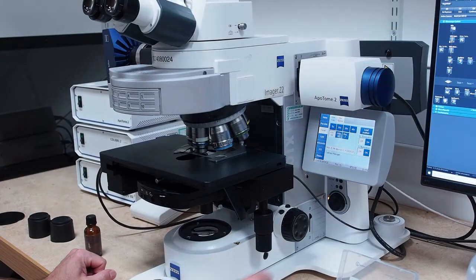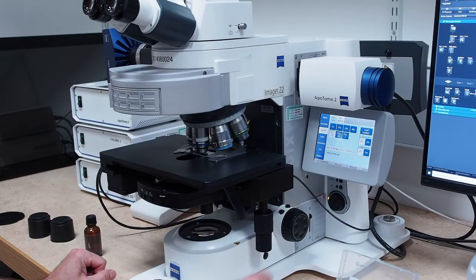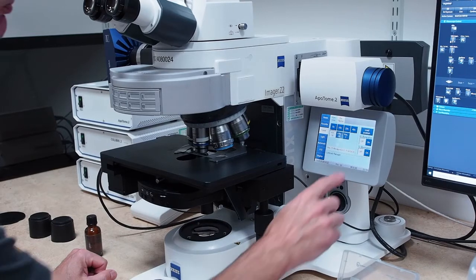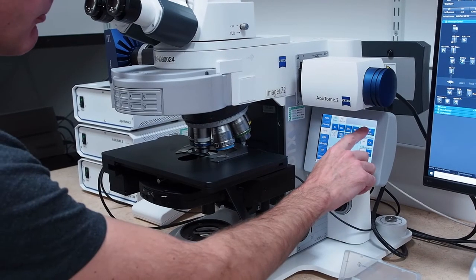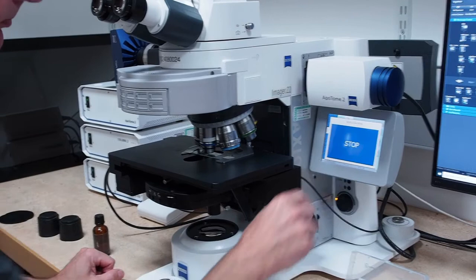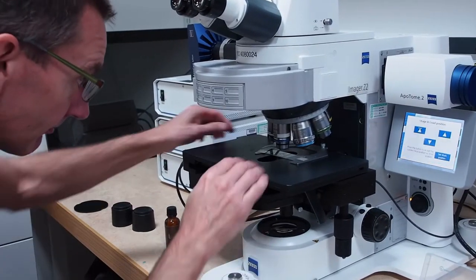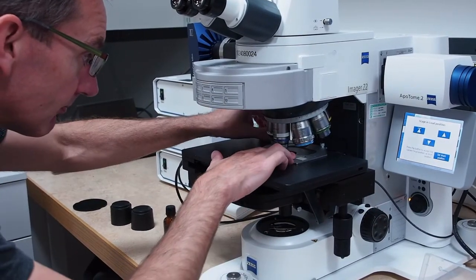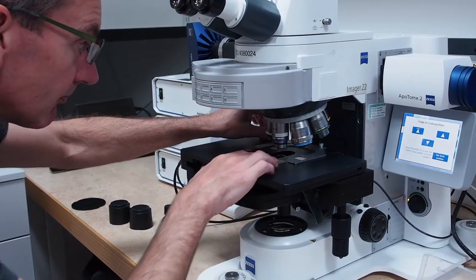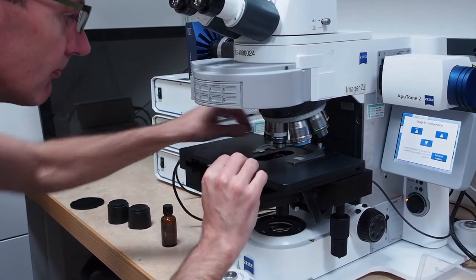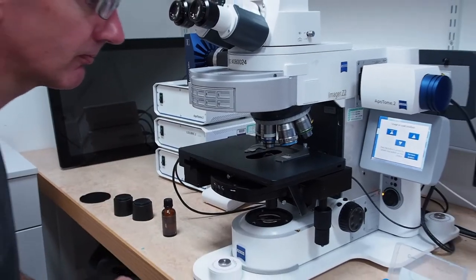Next, we describe how to remove your sample and clean the objective. Once you've finished imaging, use the load position button on the touch screen to move the stage down. Carefully remove your sample, ensuring you don't scratch the objective.